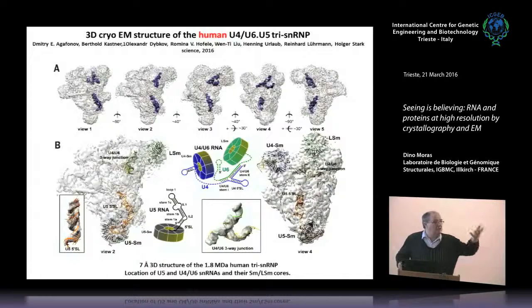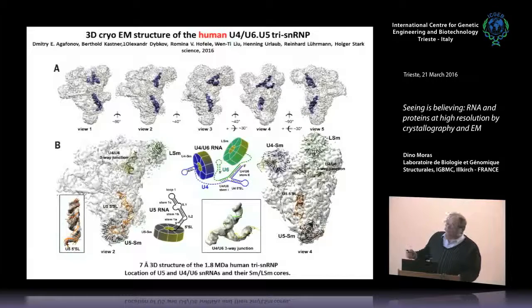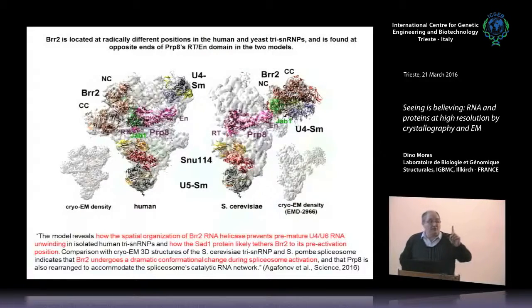You remember what I showed you before on the ribosome? At 3 angstroms, you could see the bases. It's not there yet, but they are on their way. Why is that? It's because we have these flexible molecules. So we have hundreds of conformers in the solution. So we have to average. But if you have enough data, you go for 500,000 to 5 million, which will be possible. Then you improve, you select. But it takes time, you need computers and you need models.